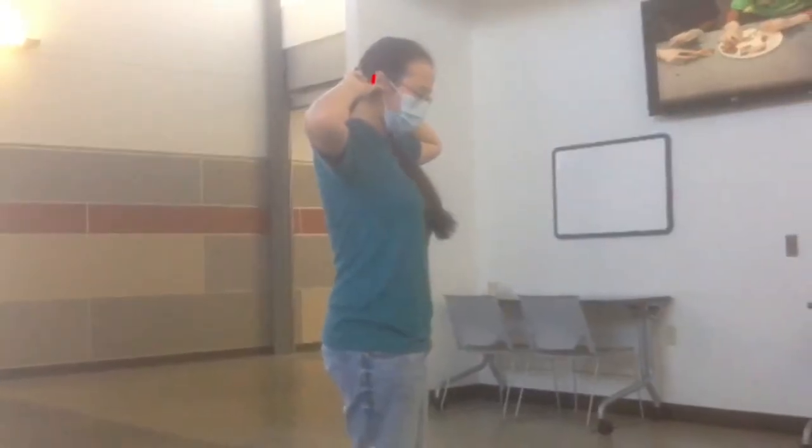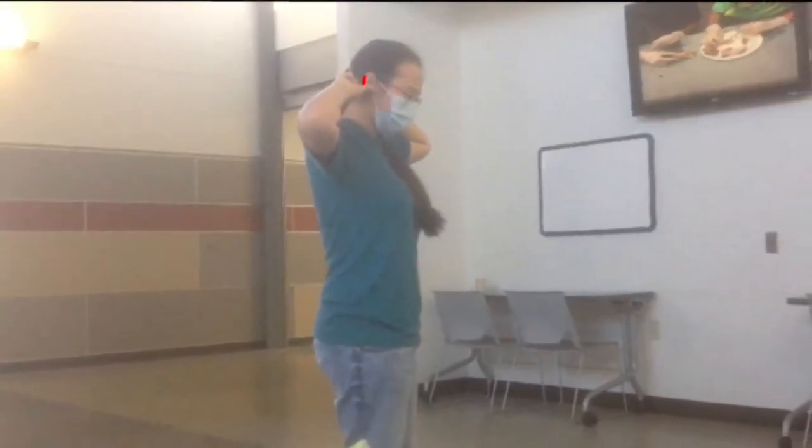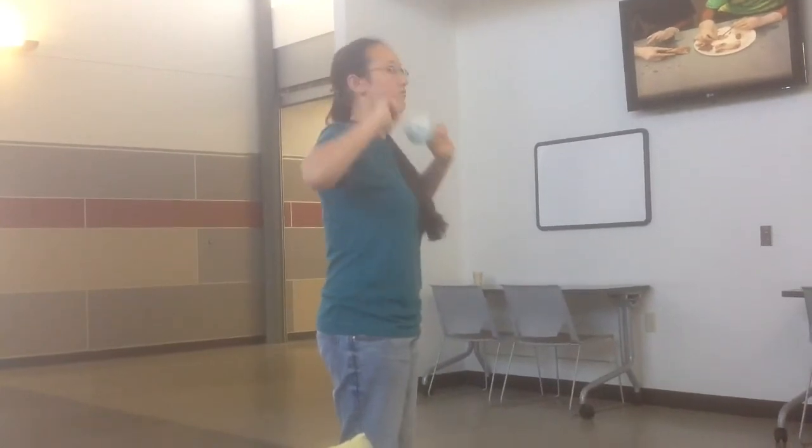Then take your mask and make sure you get behind the ears as far back as you can. Pull it off and away and dispose of it.